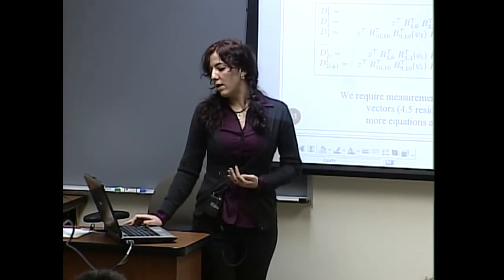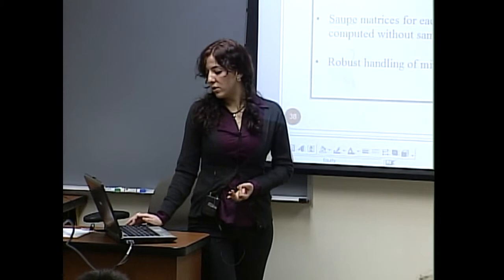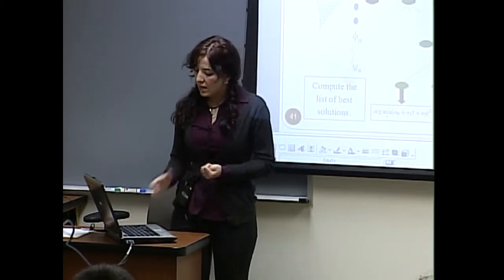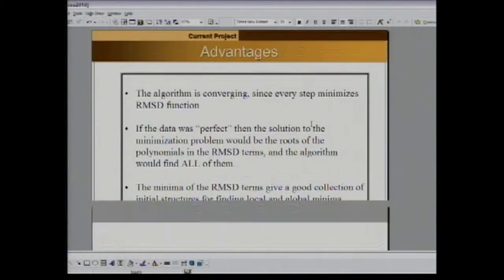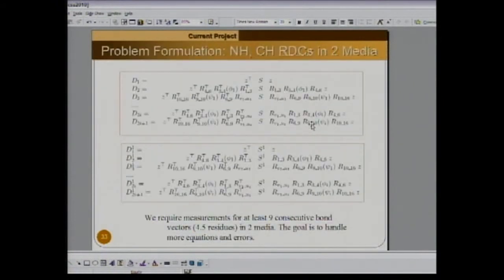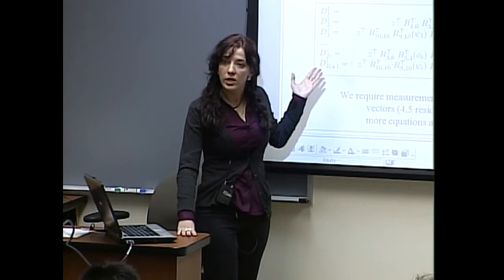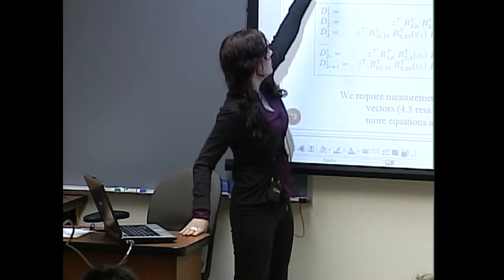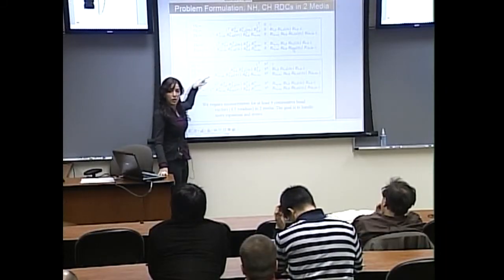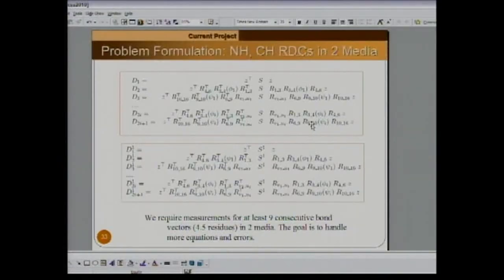And you know, in our lab, we really understand these equations well enough to have the following guarantee that I just wanted to present. This is a very important point. Let me go back to the system of equations. If the data was perfect, then solving this system simultaneously would be possible because it wouldn't be overconstrained. There would be degeneracy, but we know how to solve this system of equations when it's not overconstrained, because you can start iteratively. Each new equation has only one more variable. Therefore, you can solve the equation for the first variable and continue in a tree structure, which I'll show here.